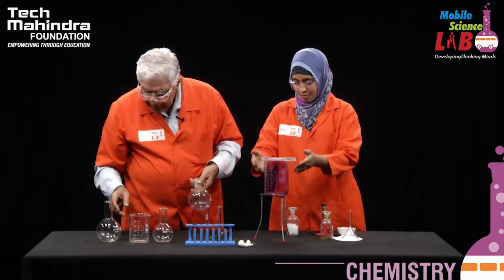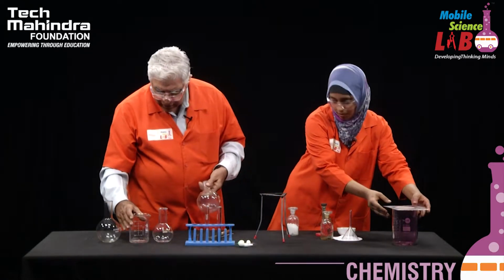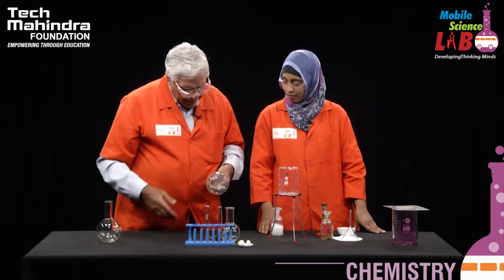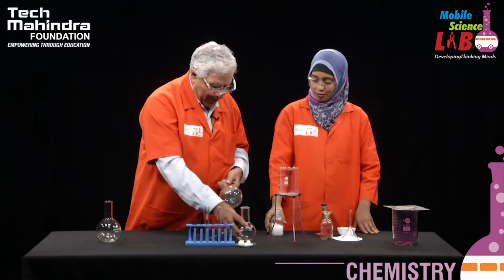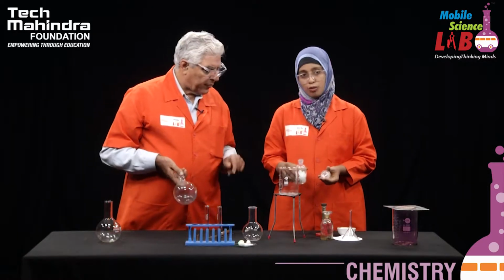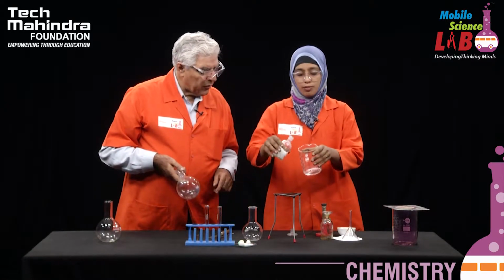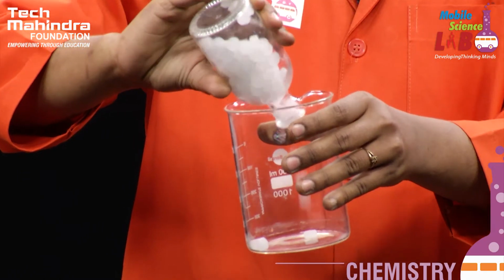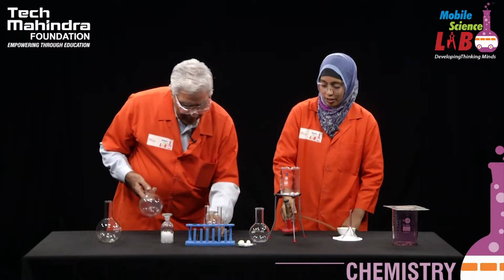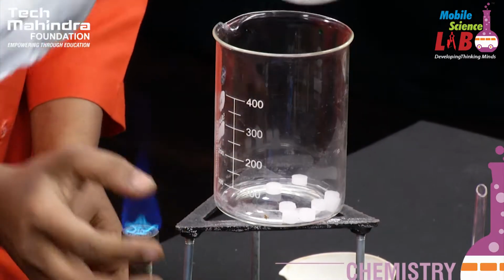Camphor. I would suggest you do one thing. You keep that over there and make use of another beaker. Yes, sir. Make use of your camphor and do the same experiment, and let us see what happens. Yes, sir. Students, I'm going to use a common sublime particle which we use in our daily life. It's camphor. So I'm going to take a little bit of camphor in my beaker. Now I'm going to repeat the experiment by heating this camphor in a beaker. And I'm going to cover this.